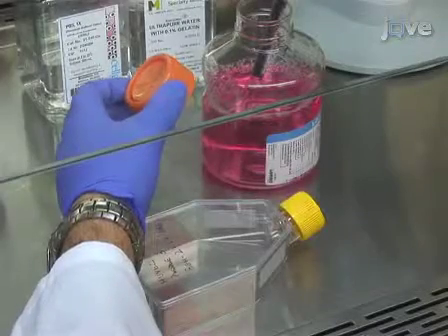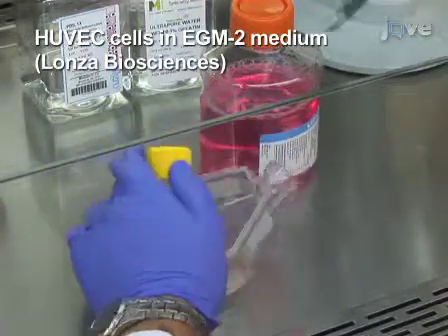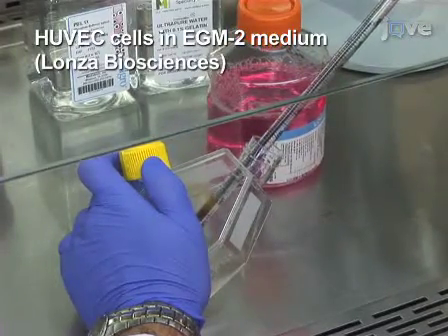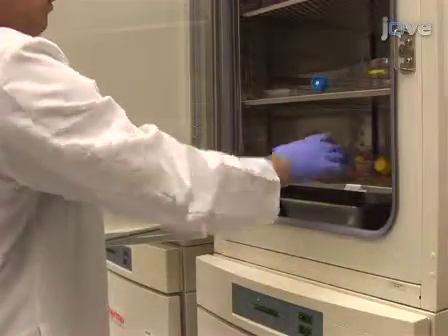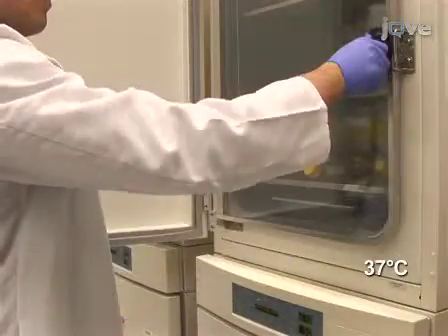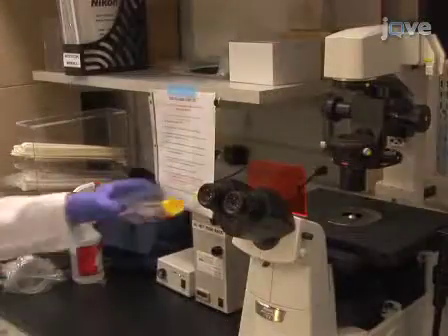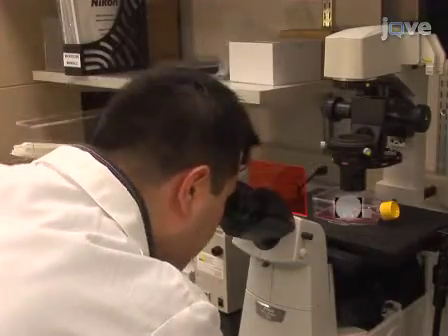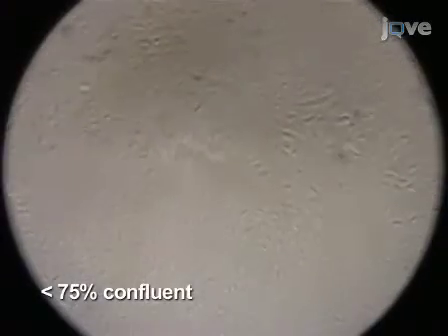The Human Umbilical Vein Endothelial Cells, or HUVEC, used here are cultured in EGM-2 medium reconstituted with the EGM-2 Bullet Kit containing growth factors, supplements, and 5% FBS. Cells should be maintained in a 37 degree Celsius incubator in the presence of 5% carbon dioxide. On the day of the experiment, check the confluency of HUVEC under a microscope. The cells should be a low passage number, preferably no more than 6, and less than 75% confluent.